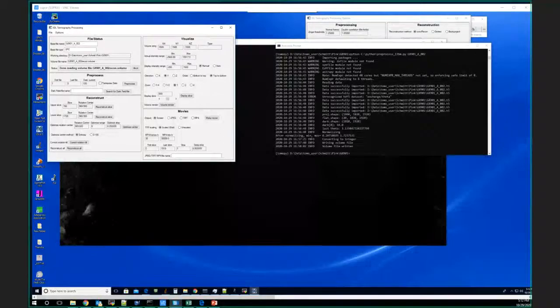Okay. So it's been challenging, but I've learned a lot about the image processing. Was this data collected on a lab machine or a synchrotron? Synchrotron. Okay. But we have a lot of those samples, so I know that we have those flash drives with all the data. Right.